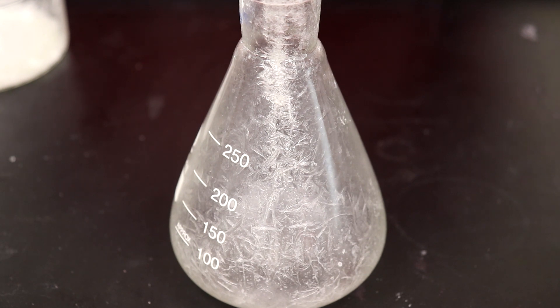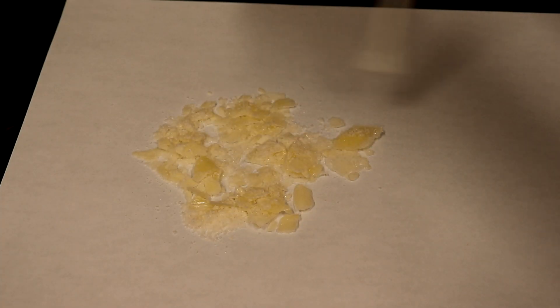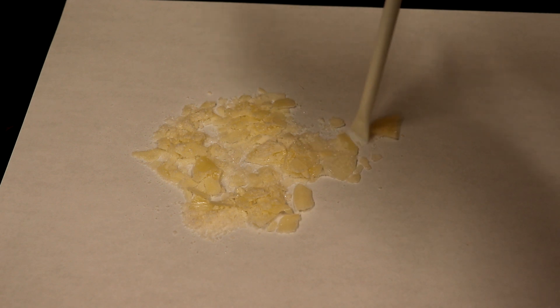The product recovered from the chloroform extraction was rather crude and had a yellow tinge to it, so it was recrystallized from hexanes.